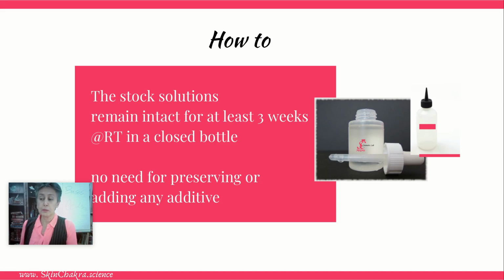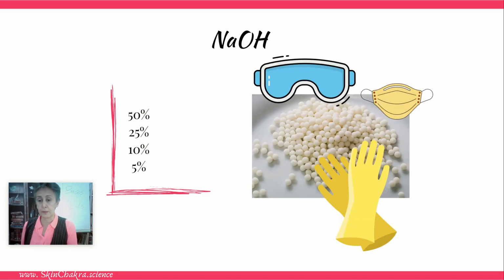Make your solutions in small bottles. If you are working usually in the range of 100 to 500 grams, then stock solutions between 30 milliliters and 50 milliliters will go a long way, so you don't need to prepare liter or 500 ml solutions. 30 to 50 ml will be okay for a very long time.